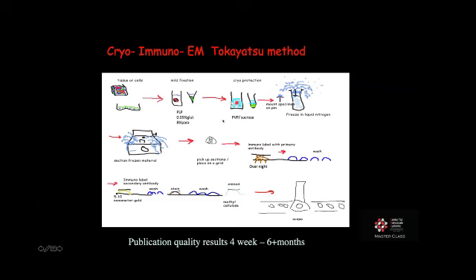This cryoprotection infuses the tissue, separating the water molecules a bit, so that when we freeze in liquid nitrogen, we don't need to go to heroic methods of freezing this. We can just plunge freeze it by hand, and we won't get any ice crystallization. We'll get very close to vitreous ice if we use a cryoprotectant.